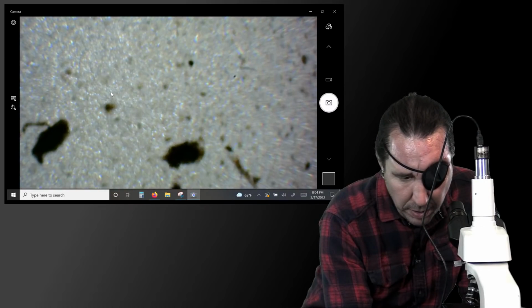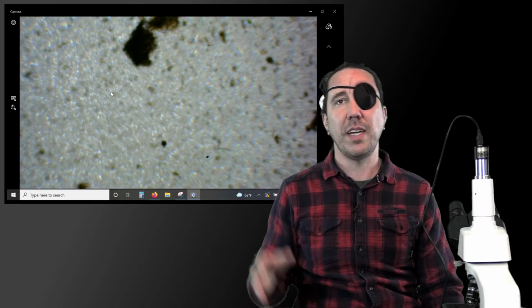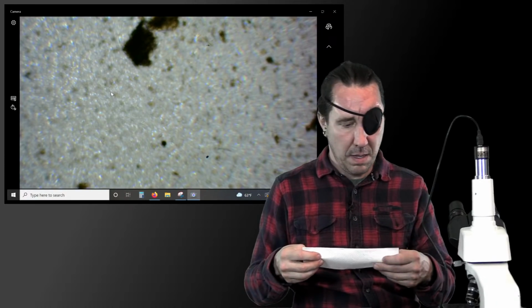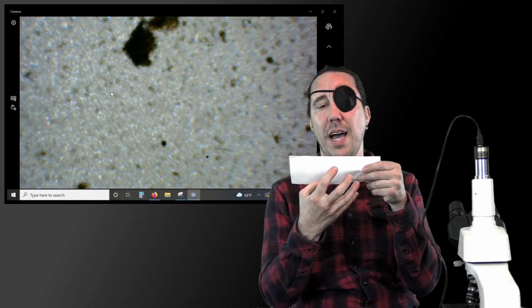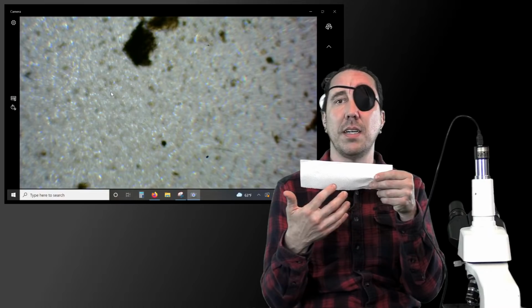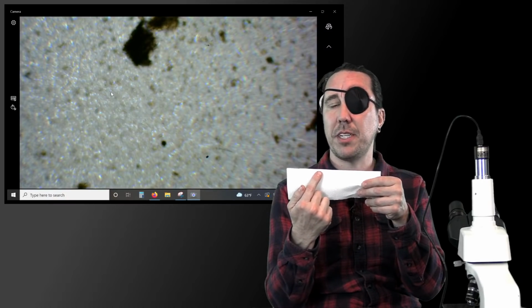I'm going to pause real quick so that I can tell you about nematodes. So let's say we've seen a nematode in here, even though we're not seeing one. We saw one moving. We noted where it's at. If this were my slide, let's say that we saw it up here. Then we want to make sure in our memory to go back. We've done all our other counts of protozoa and fungi and things like that. We'll come back. We're like, okay, that nematode was up here.